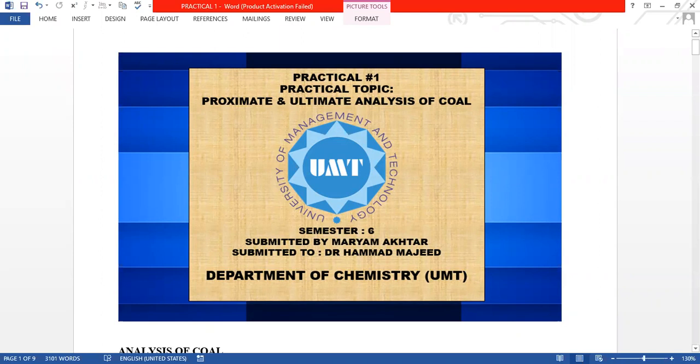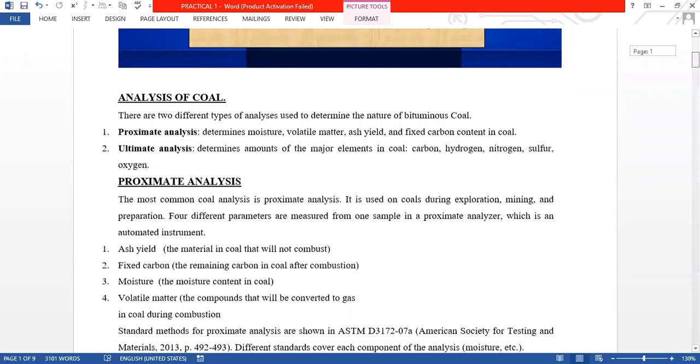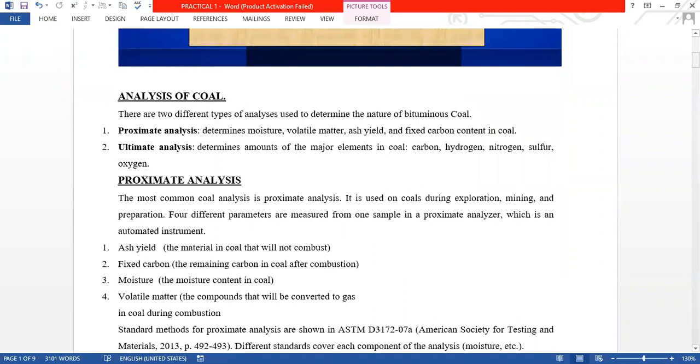Today I'm here to represent the topic of my practical, which is proximate and ultimate analysis of coal. Before moving toward my main practical, I would like to tell you the theory of the analysis of the coal, which will cover proximate analysis and ultimate analysis.